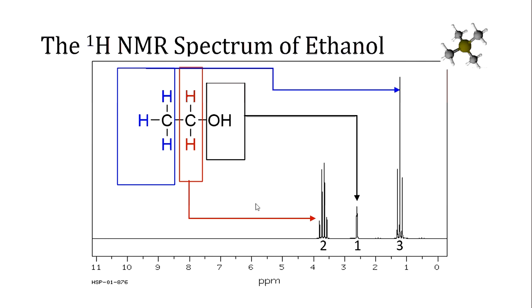But while the splits in the other peaks are sharp lines, the OH peak looks a little broader. And that tells us we've got some hydrogen bonding going on. If you remember in IR spectroscopy, the peaks of hydrogen bonding things are broad because of hydrogen bonding. Same thing goes on in NMR spectroscopy.